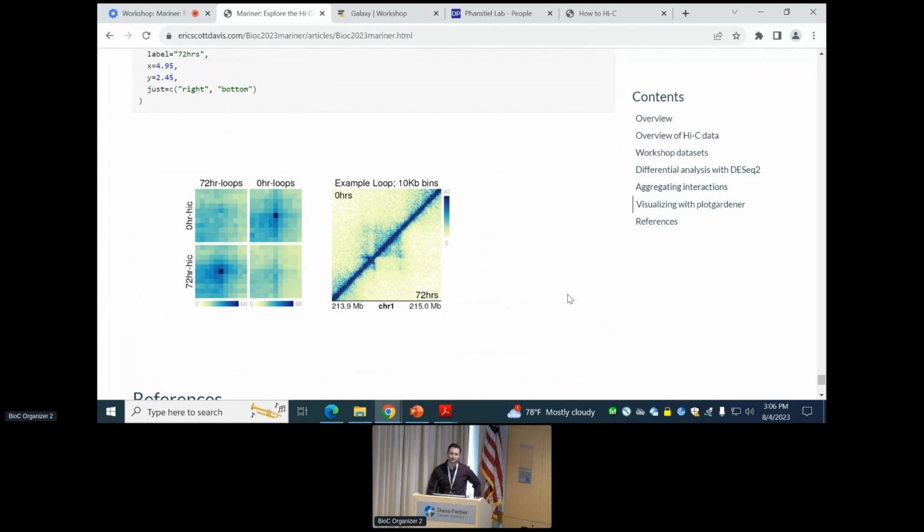So those structures are not part of the bioconductor ecosystem. They are part of the package. Those three classes. This is a bioconductor package, so hopefully they extend current bioconductor. So the bioconductor class would be interaction set, the most used container for interactions and things like that. So these sort of extend that functionality to allow you to incorporate additional HiC files.